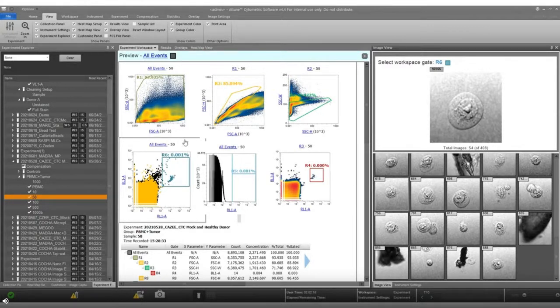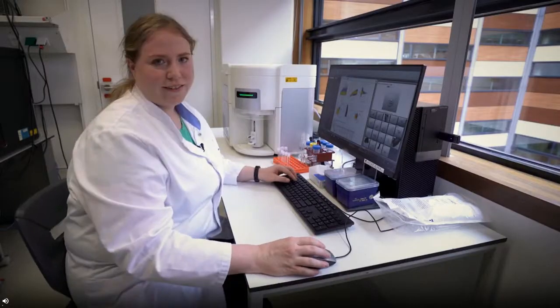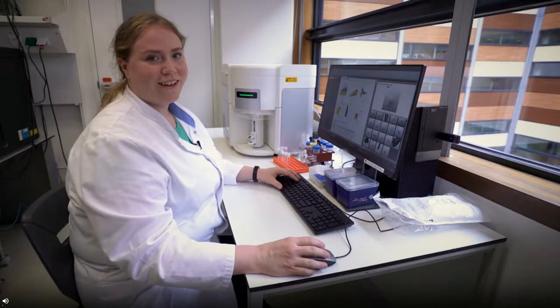However, once we start going into actual patient samples and we are not just looking at tumor cell lines that are nice and clear that you have a single cell, this will become much more muddy. And so we're in the middle of that project, and I'm really excited to see how that develops. That is all I have to share with you today on the system.